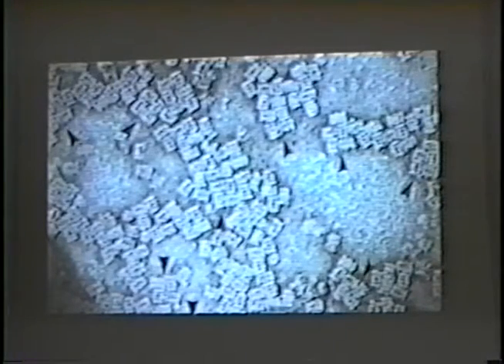This is an example of the negative staining carbon film technique performed using cylindrin, but in the absence of polyethylene glycol. The molecules have clustered together in several places, but these clusters do not really show any degree of regularity. Indeed, the black arrowheads indicate groups of 4 molecules which are coming together in a regular manner, but in a manner that really prevents a further build-up of a 2-dimensional crystalline array. These molecules are offset end to side, end to side, end to side, as groups of 4.